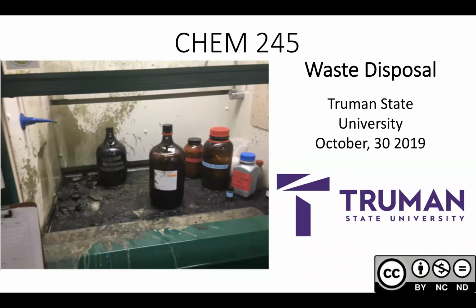It turns out you can get into issues with something as simple as waste disposal, as actually happened here last year. This picture was taken down in the PCHEM lab, where somebody decided to add a little bit of inorganic waste, including some oxidizing agents, to an organic waste.